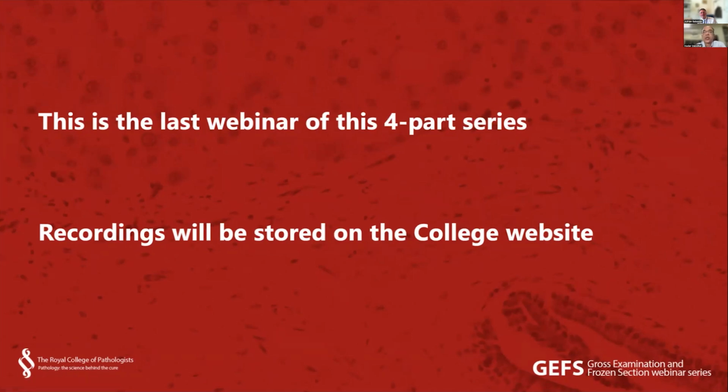Okay, so right, well, there's one practical question. How can we tell the difference between adherent omental fat involvement, which will be pT4b, and pT3 disease where fat has crept onto the antimesenteric border? Particularly where microscopy was done by another colleague, and so you haven't seen it. So how do you distinguish between them? That's very difficult. I know what you mean. That's very difficult because it's hard.